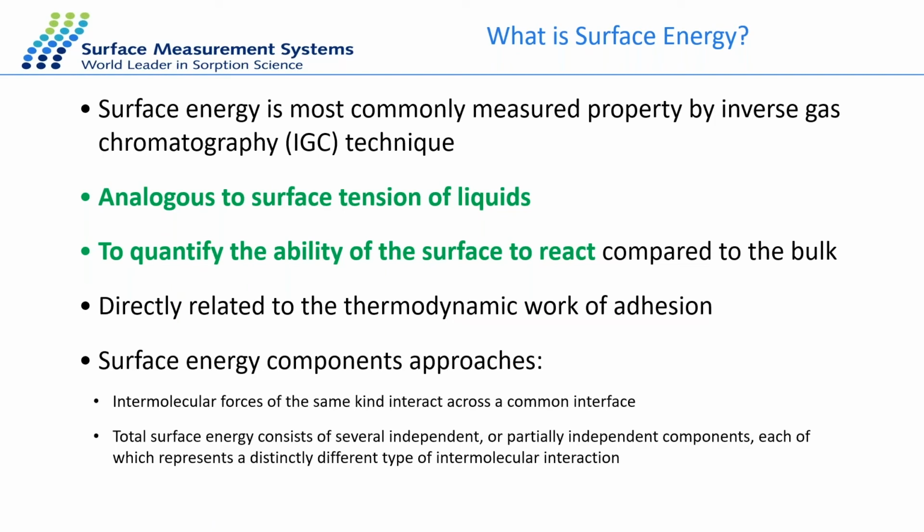And surface energy has different components. Fowkes was the first who expressed the surface energy with different components, dispersive and specific parts.